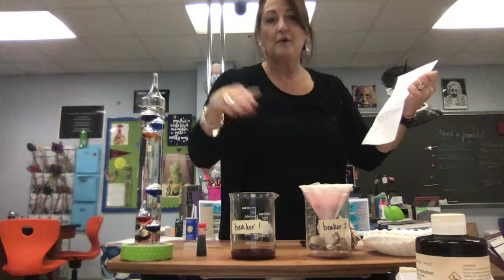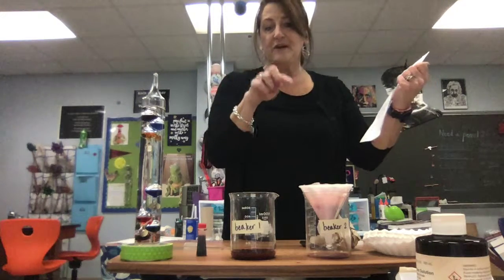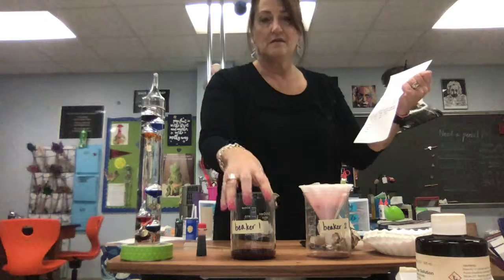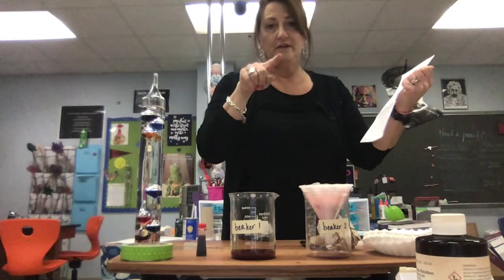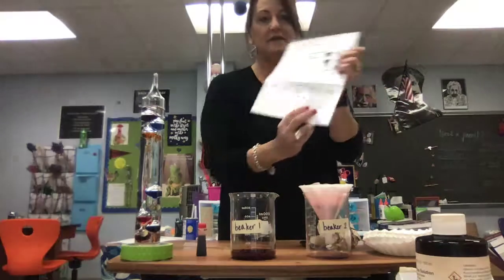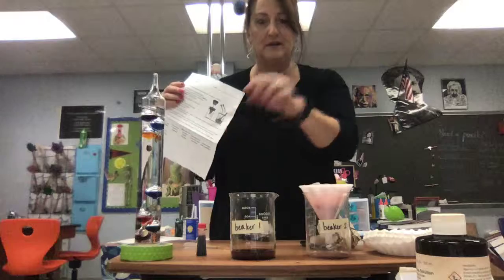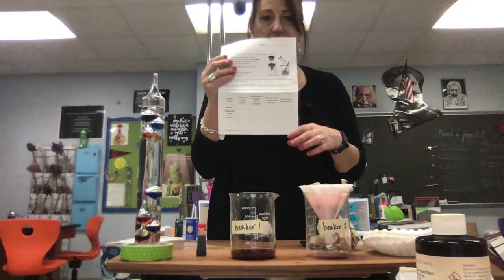Where in our model, I want you to think about what you learned yesterday about how many times blood gets filtered in your urinary system. And then what is the organ that this is representing? Beaker 1, the coffee filter paper, and beaker 2, okay?